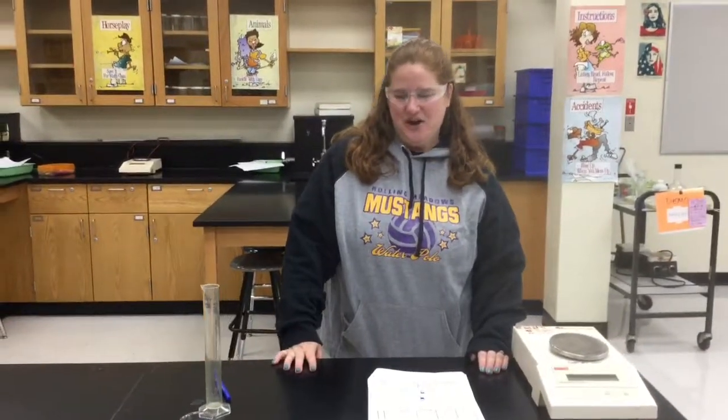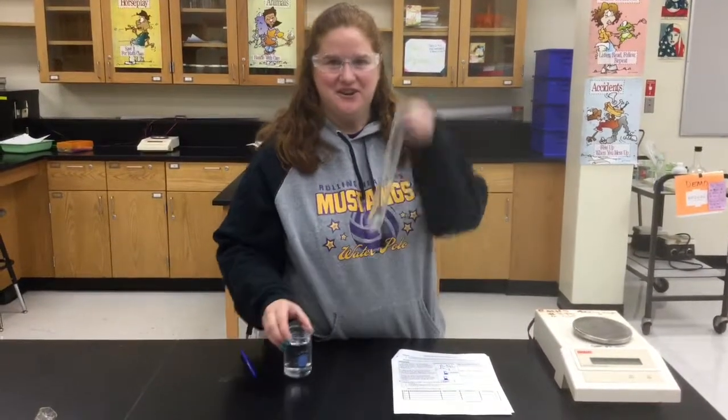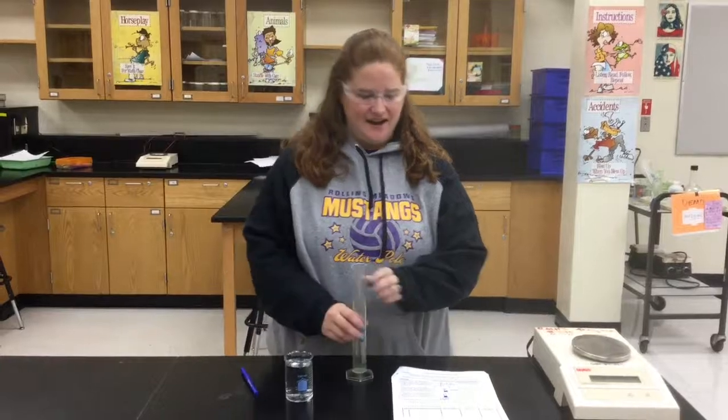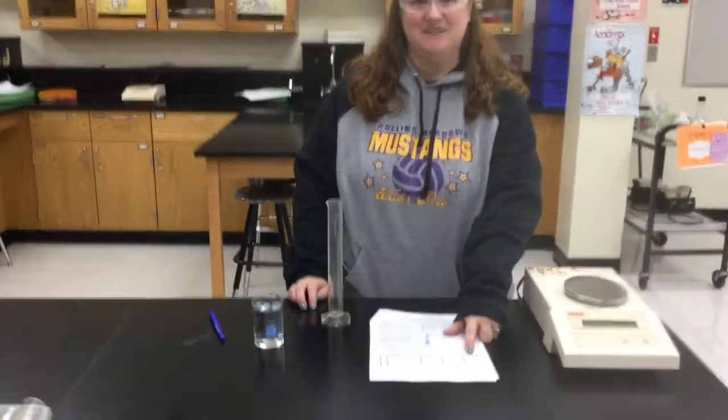Dorian. What are we doing? Oh, well, today we're going to find the different masses and volumes of water. What's our end goal to try to find? I feel like it's density because it says density at the very end of my data table right here. Yeah. I think we're going to learn by using data to calculate a property of water.